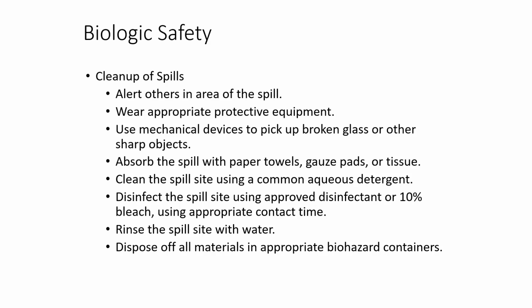So, biological safety. As I mentioned previously, the most common biohazard that you're going to be exposed to in clinical chemistry is blood. So if you spill some blood, cleanup of spills is essential. You want to alert others in the area of the spill so they don't accidentally happen upon it and get exposed themselves. Wear appropriate protective equipment. Use mechanical devices to pick up broken glass or sharp objects. You never want to pick up glass with your gloves or with your bare hands, especially once it's contaminated with a patient's body fluid or blood.